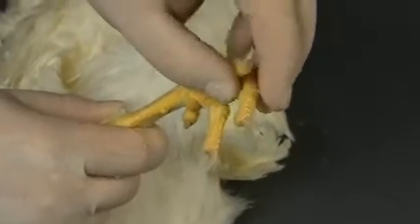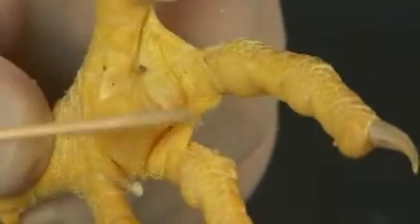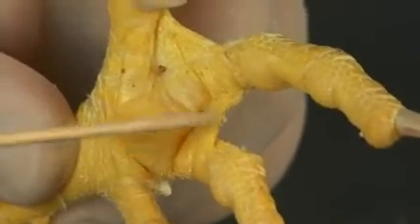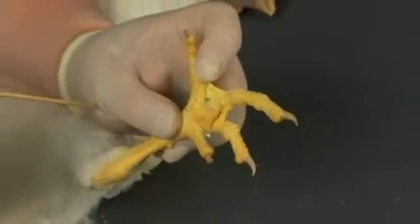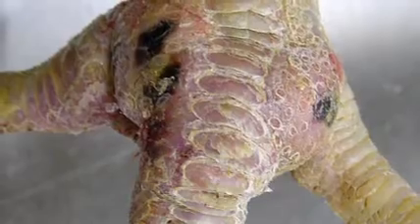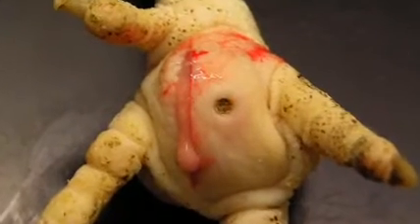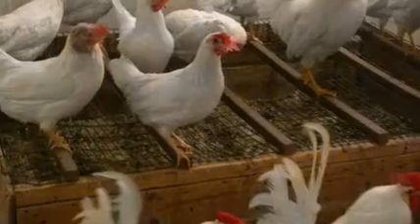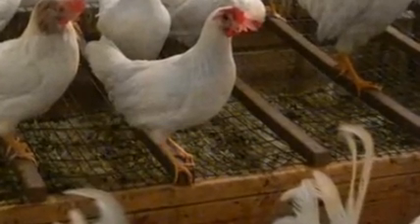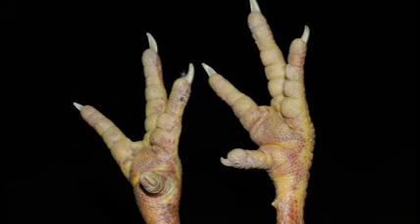Flex the joints and palpate the digital pads. The pads are composed of thick skin and adipose tissue. The foot also has a large central metatarsal pad. This pad should be soft and free of scabs or swellings. If it is firm, ulcerated, or covered by a scab, the bird may have a deep infection called bumblefoot, caused by staphylococcal bacteria. This condition is associated with inappropriate substrate, and the husbandry should be evaluated. Look for any other foot abnormalities such as edema, hemorrhages, or other lesions.